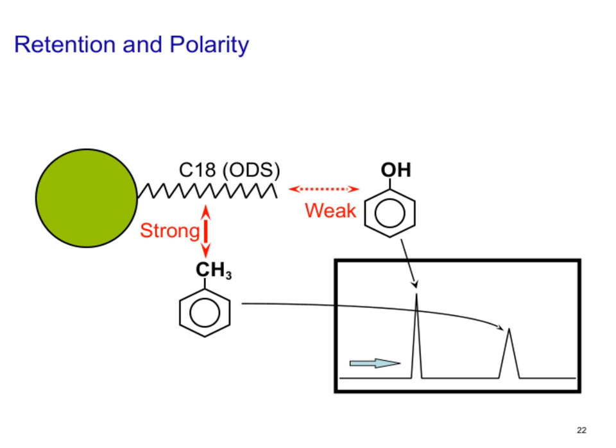Overall, understanding how different functional groups like OH and CH3 influence polarity helps us predict how compounds will behave in the chromatography process, especially when using a C18 stationary phase. This connection between polarity and retention is fundamental in optimizing separation techniques.